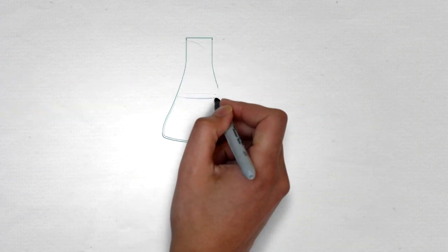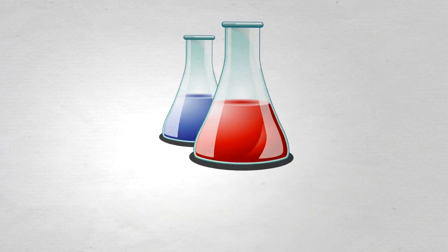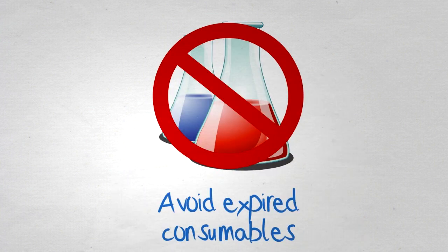How would you like someone at your bench to prevent you from making an error that would waste precious time and consumables, not to mention irreplaceable samples? STaCS does that. Not only will STaCS indicate that a particular lot is about to expire, but STaCS prevents you from using consumables that have expired. It also prevents you from using consumables that have not yet been released for laboratory use.